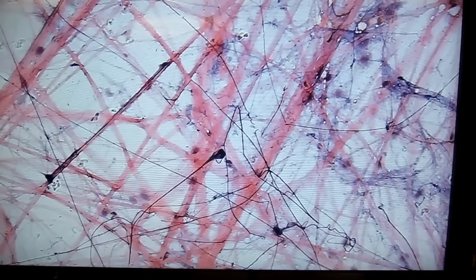You can see that the fibers are pretty much randomly distributed in there. There doesn't seem to be any order to how they're placed in the tissue. You can also see some nuclei.